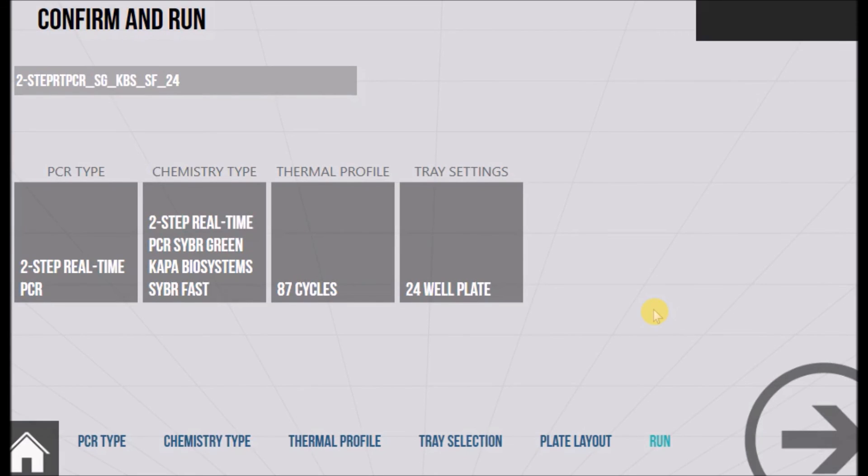This final page is a summary of all the parameters the user has chosen. You can enter a file name up here and then press the next button to run.